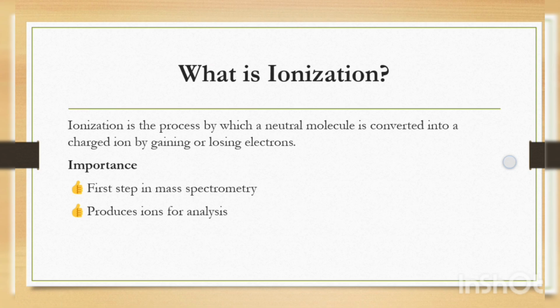So remember this simple sequence: neutral molecule, after that the ionization process, then ions are separated according to the M/Z ratio, then detected. Today our main focus is the first step, ionization.